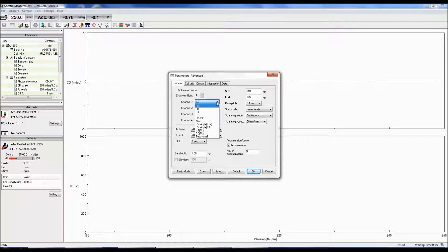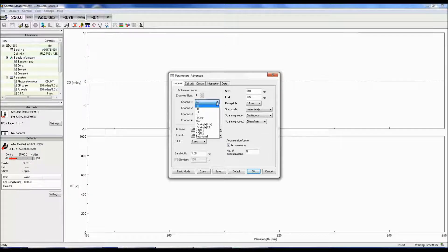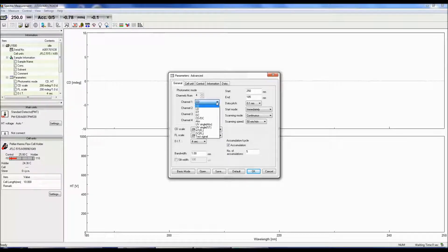CD over DC is the same as the CD signal when the DC is set to 1 volt. This mode is useful when the DC varies with the sample absorption and the HT is fixed.